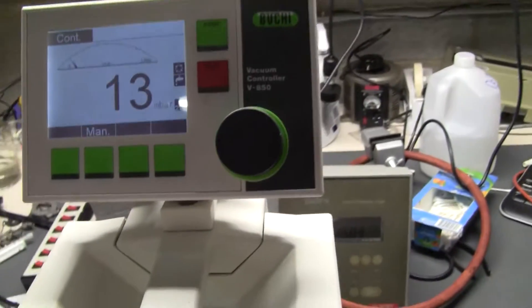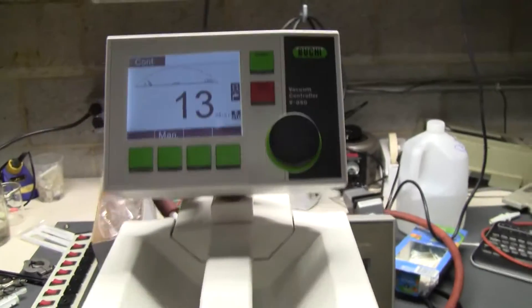Hi, this is Michael Nakedown from Hitech Trader. Today we're looking at a Bukki V850 controller with a V700 pump, diaphragm pump.